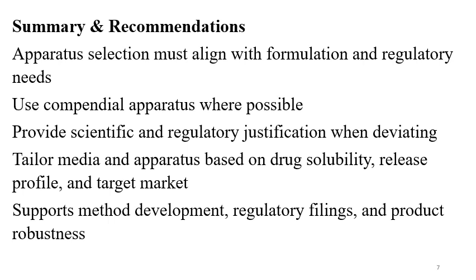That means always have 12 unit data for the RLD or reference formulation and the test formulation in different apparatus. Then only you can finalize the apparatus and it will have scientific justification. If you need to use, for example, apparatus paddle type 2 for the capsules, then you can use sinkers as well.